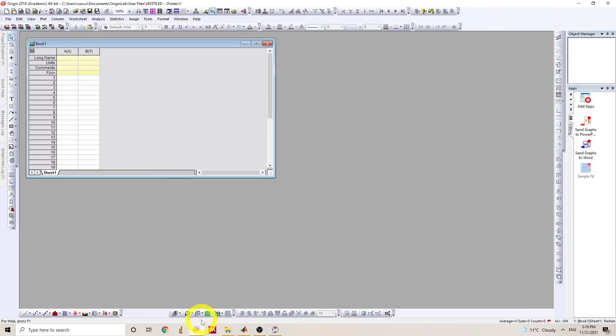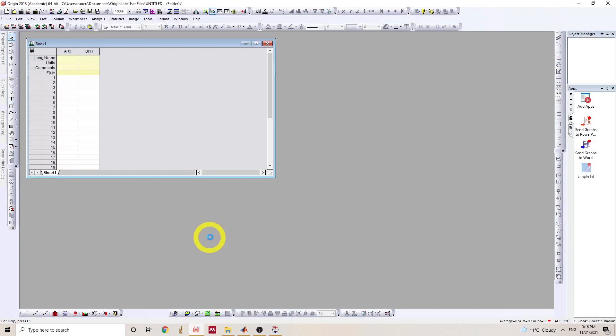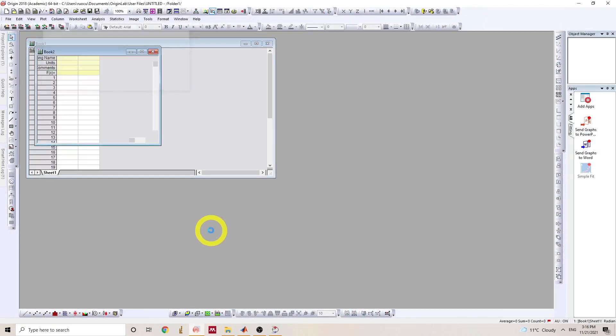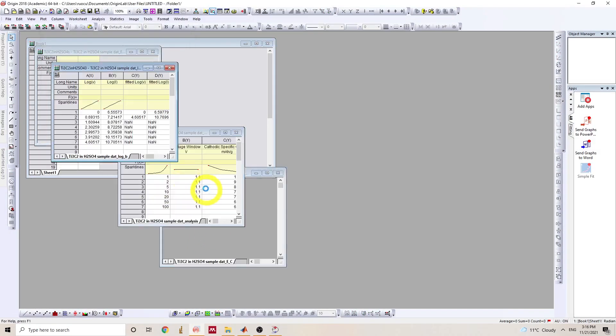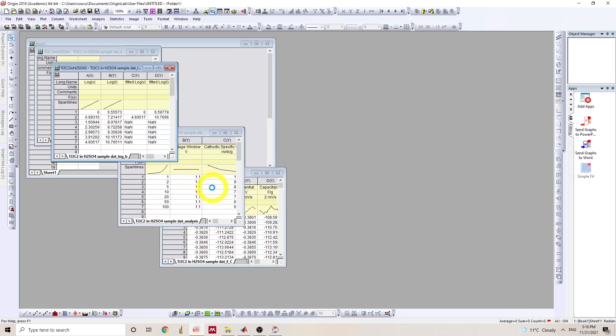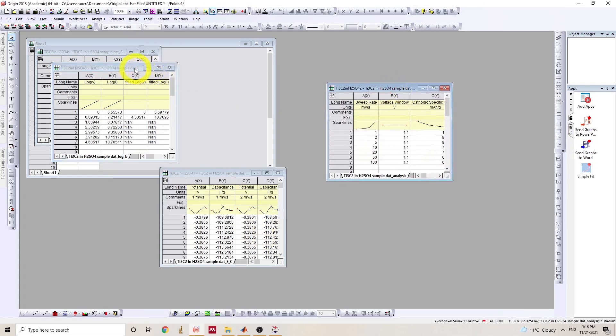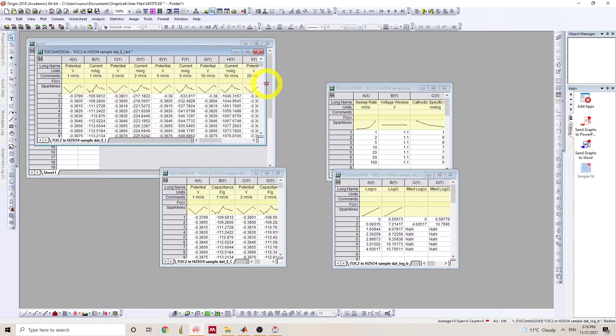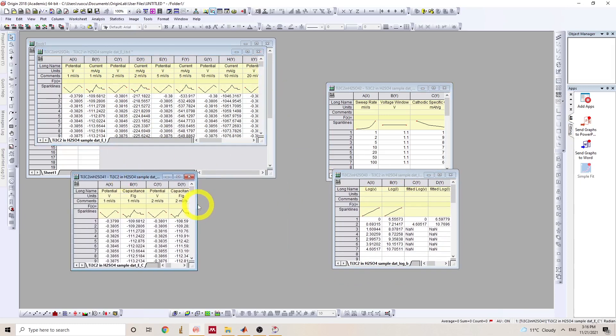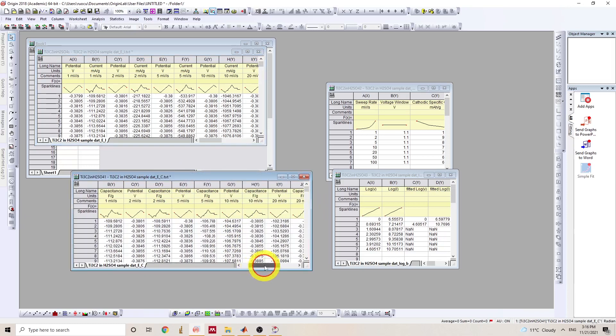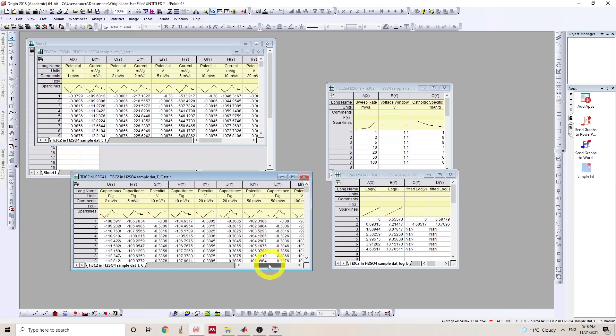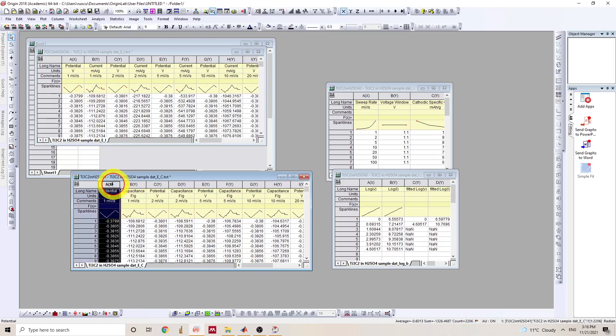So I use Origin to plot the data. So we can just drag all these files into the Origin interface. So we have the four folders here. And I would like to start with EC, which is potential against capacitance. So it's normalized current. So it's current divided by the sweep rates.